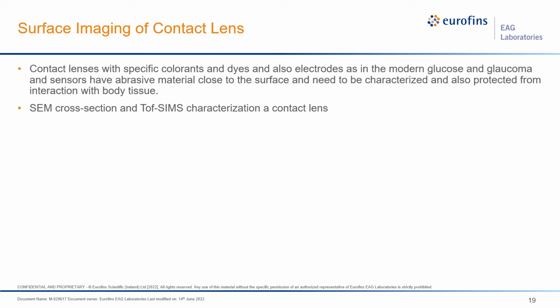Imaging and understanding particulate chemistries is also very critical. With advances in technology, contact lenses with colorants and dyes, and as I had mentioned earlier, ones with electrodes and sensors, have abrasive material close to the surface and need to be characterized, and also protected from interaction with body tissue.